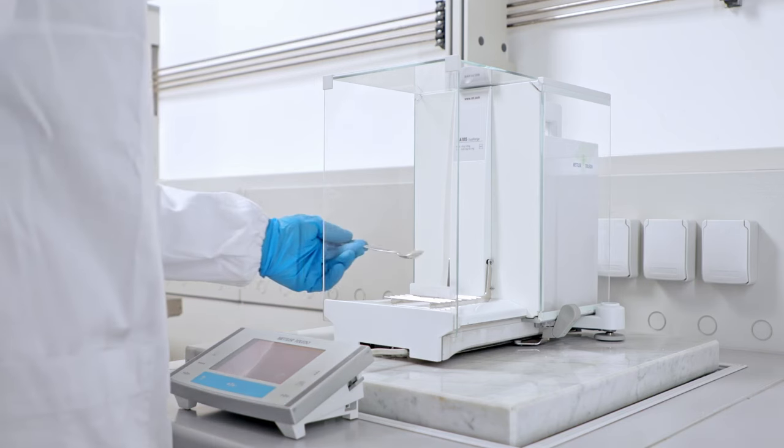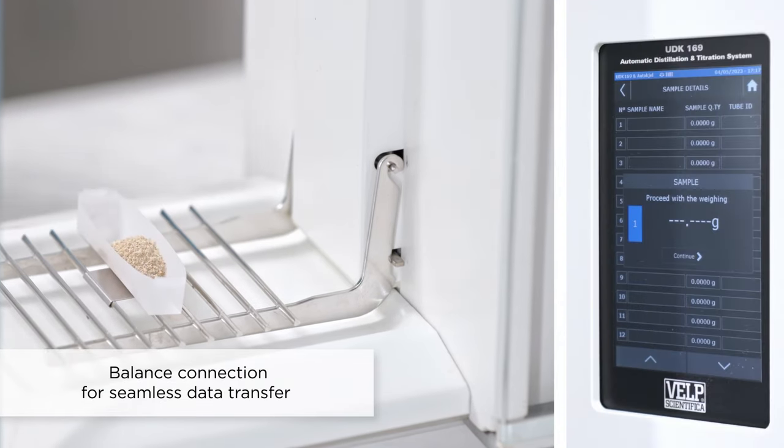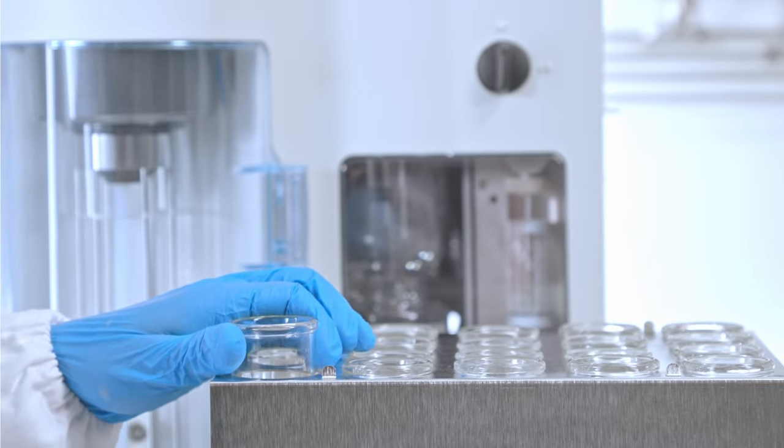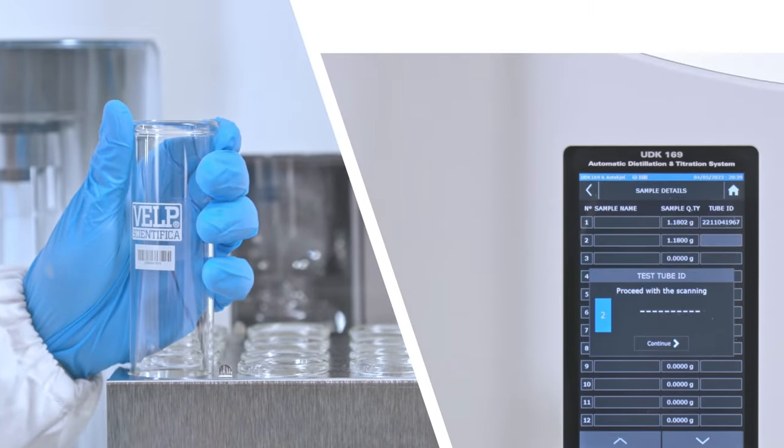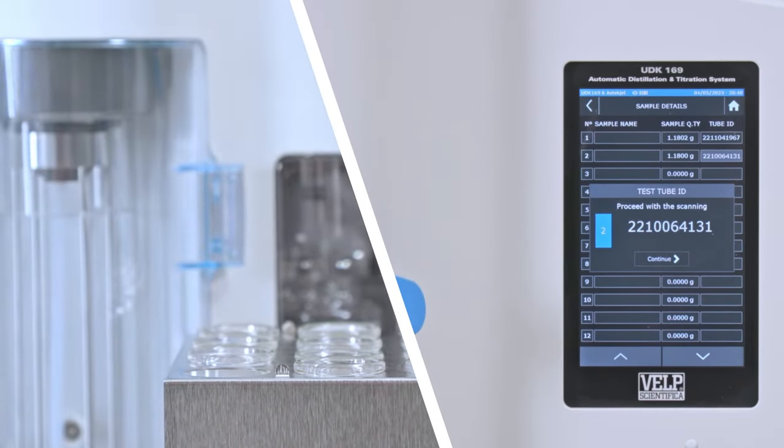To start the analysis, homogenize the sample and transfer it into a VELP test tube, connect the UDK169 to a balance for seamless data transfer. The optional barcode reader simplifies data management and speeds up the analysis preparation, avoiding transcription errors.